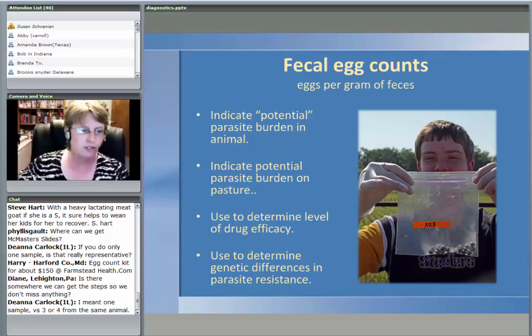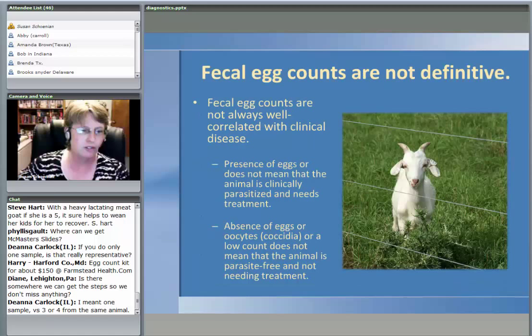If you had three chambers, that would increase it. We often ask that, and when we get the data back, it becomes an issue of what's practical. If I send three or four from the same animal, that's three or four things I have to pay for. So on ours, I've got nine samples from the same buck, and if he's low all summer, that's probably pretty indicative that he's resistant. But the more you do, yes, the more accurate it's going to be. Because definitely one of the limitations is the technique itself.